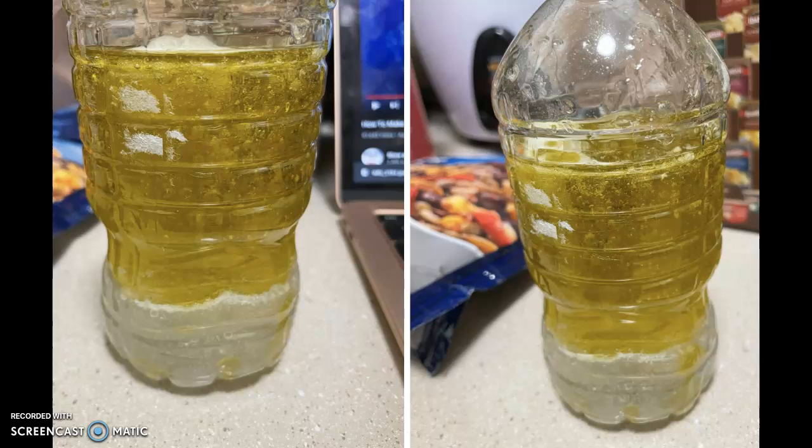I'm going to be explaining my lab for today. It is the week 4 chem lab, the lava lamp lab, and we're going to be talking about acids and bases again. And then I'll explain why the reaction took place and the steps I took to create the lab. For starters, I did look at the reference video. I want to make sure I did things right since the last few labs didn't really go as planned, and it kind of threw me off a bit.